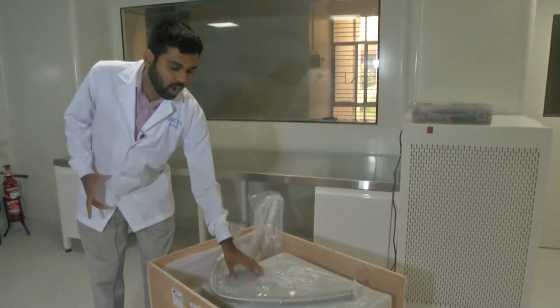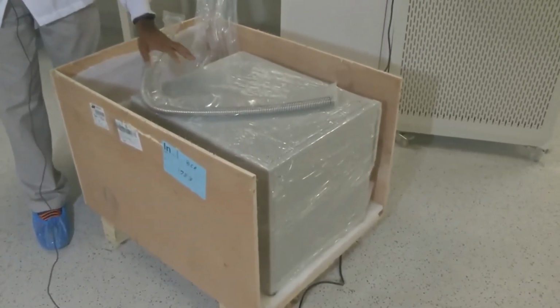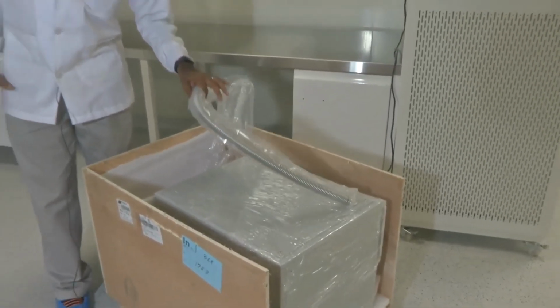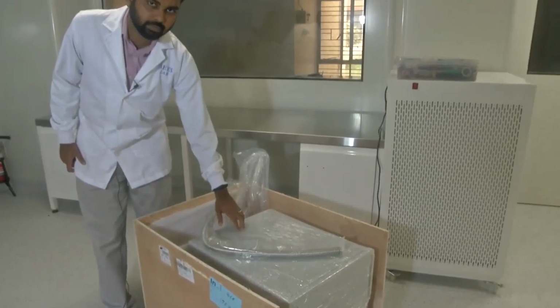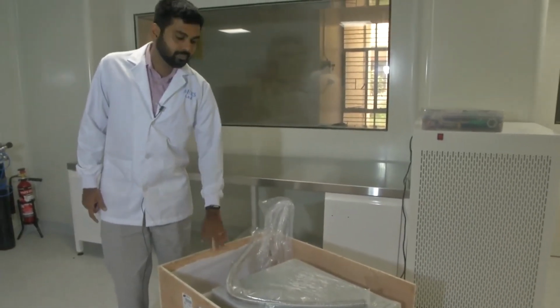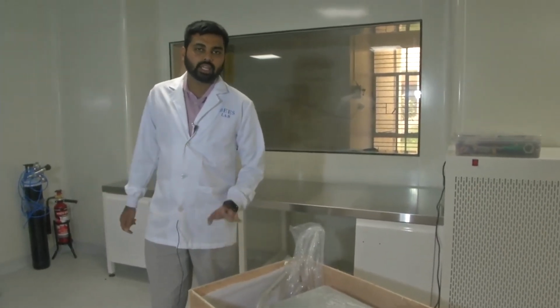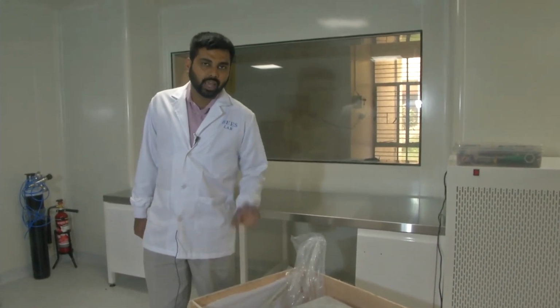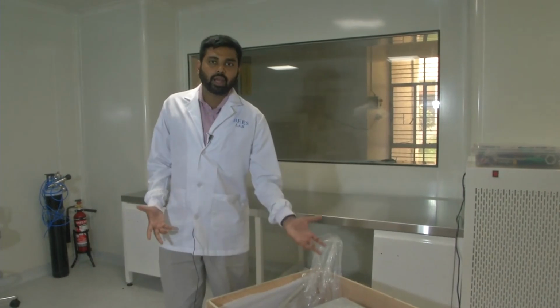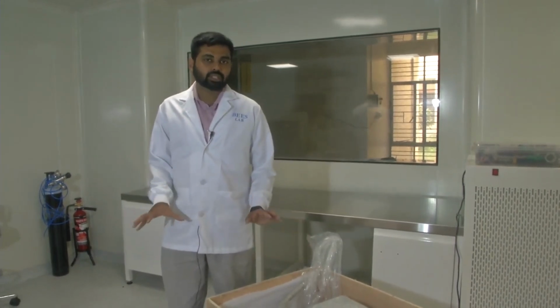So this main box here is the chamber of the plasma system. This is the chamber, we will be showing it to you. This is a pipe that will be connecting the vacuum system to this chamber. The vacuum system is also here next to it, we will show it to you, it is there inside. Then another important thing that we need is an oxygen cylinder, which we will be connecting and showing to you. Oxygen cylinder, vacuum system, and a chamber for creating the plasma are the main components of an oxygen plasma system.